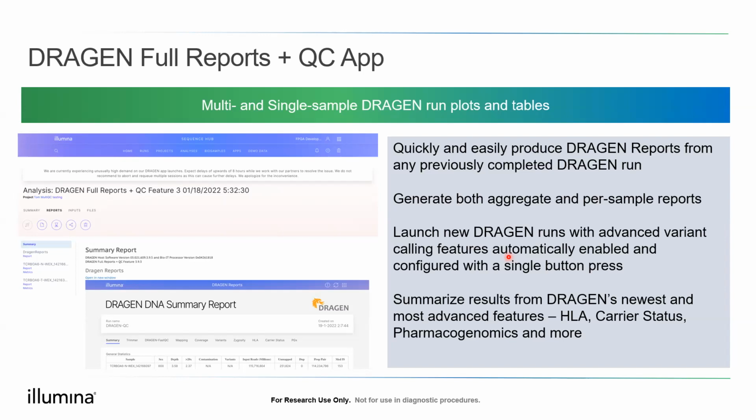So again, I think a feature that can quickly help you glance at how your samples are doing, how you can see any differences that may have happened over the sequencing step for a certain sample versus over a cohort of samples. So I think with that said, this is my last slide.